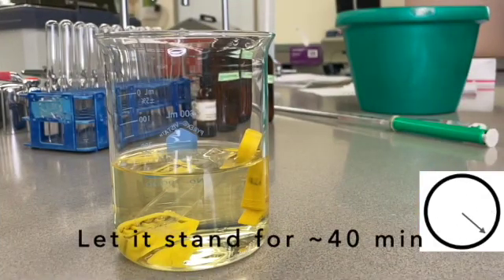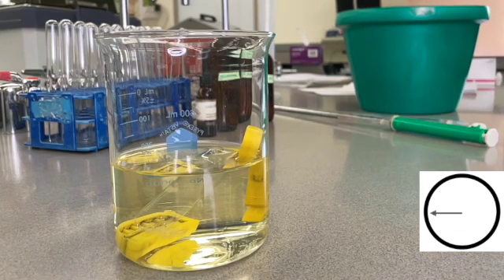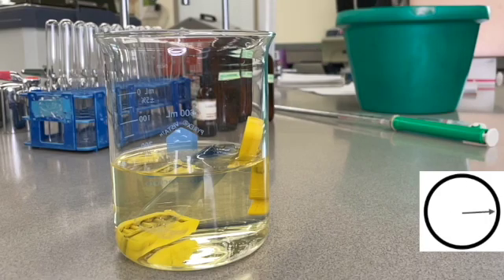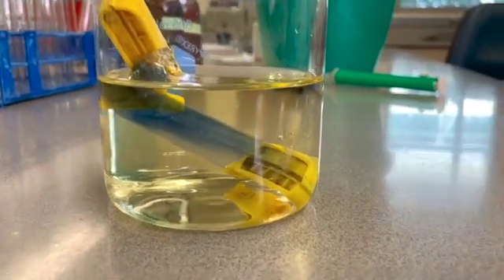And we wait. Keep a close eye on the dialysis tubing and the beaker solution. If you notice any changes, go ahead and make a note of them in your notebook. Minutes are over, it is time to make final observations on the dialysis bag and the beaker solution.